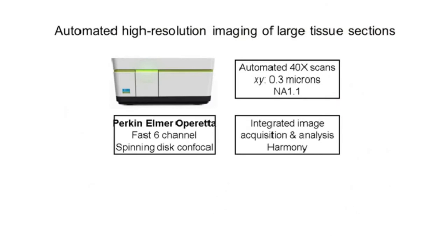After we automate pathohistology, single molecule FISH and antibody staining, we use an automated spinning disk confocal that can take images really fast, and it can deal with large image data. The system that we use for this is the Operetta CLS from PerkinElmer. This Operetta system was originally built for automated high-content in vitro screening, and we ended up adapting some of these plate-based screening properties to the tissue application.